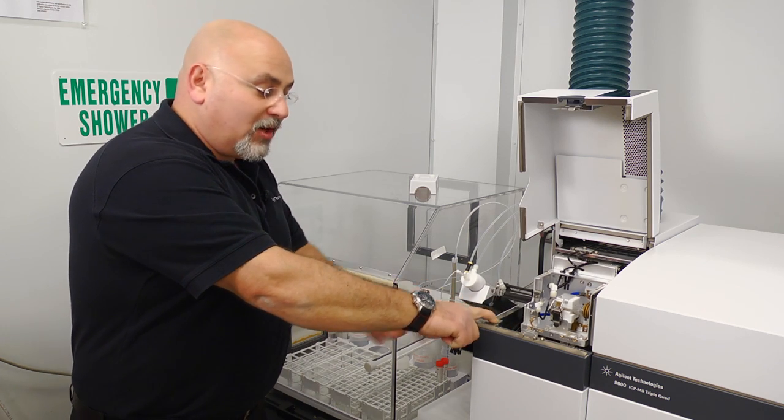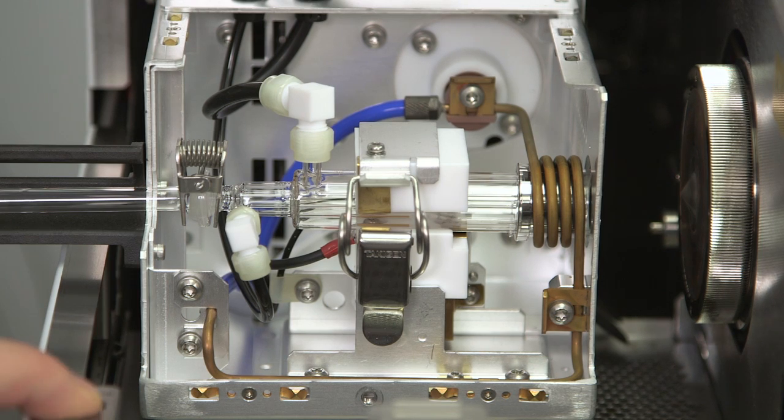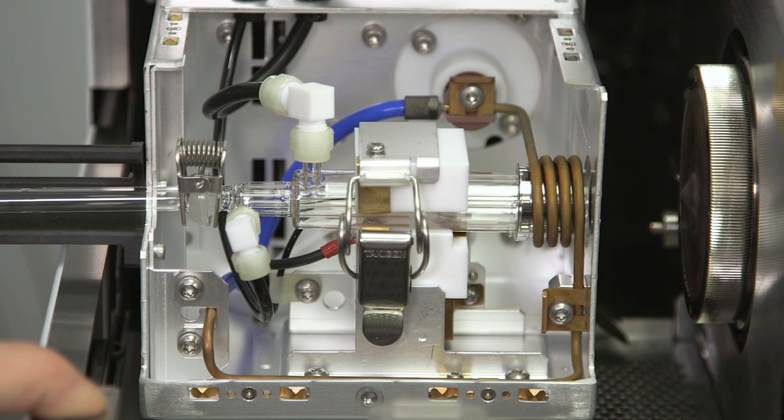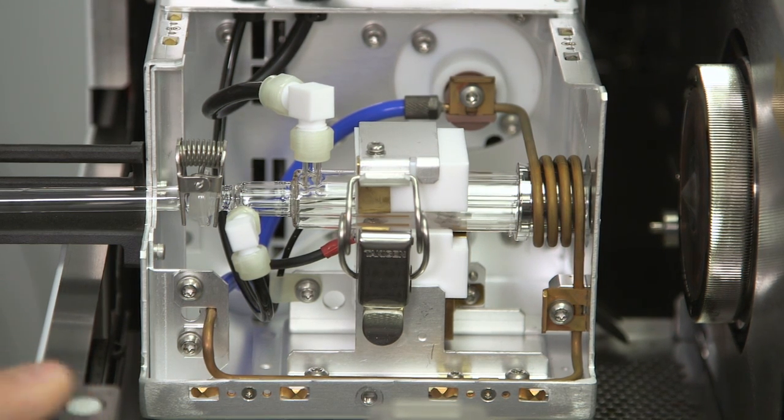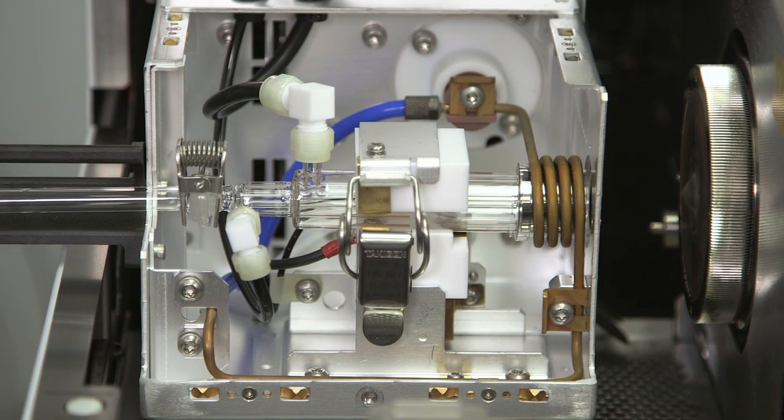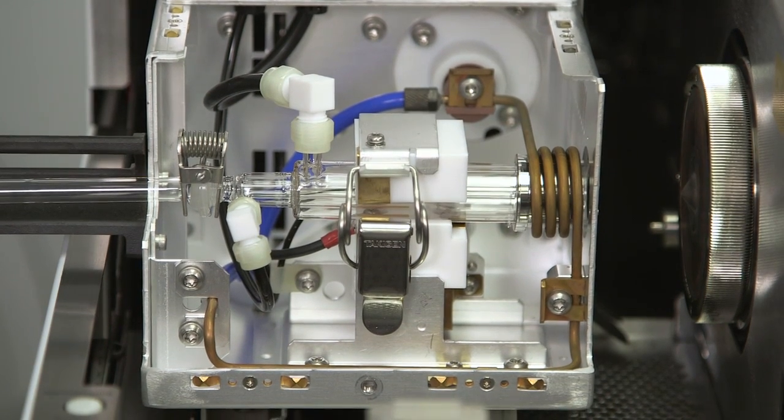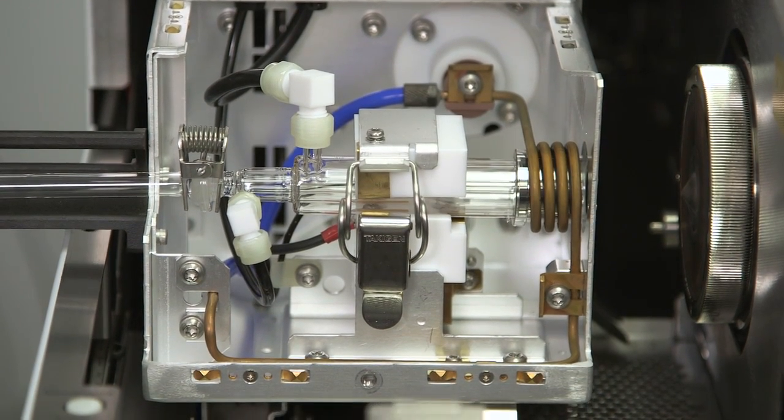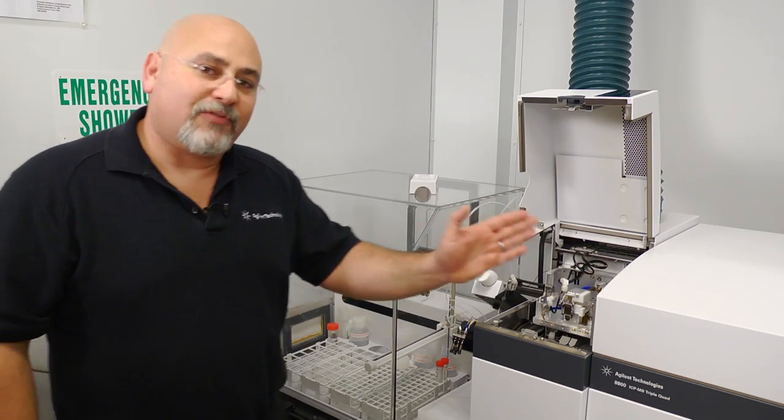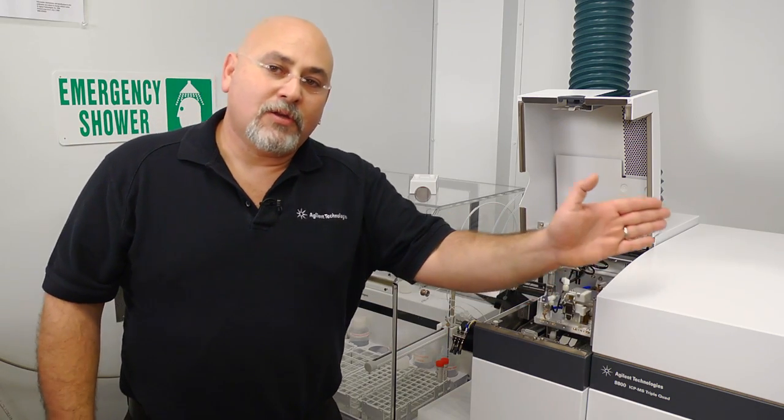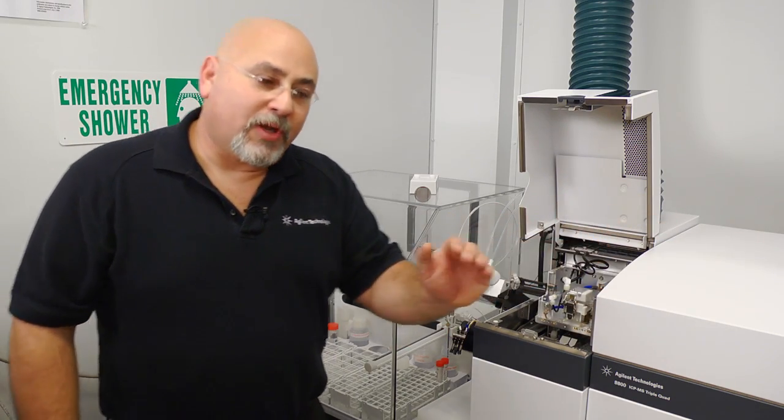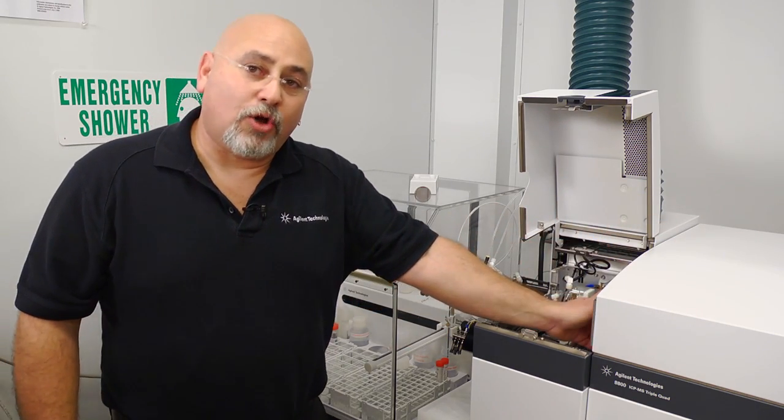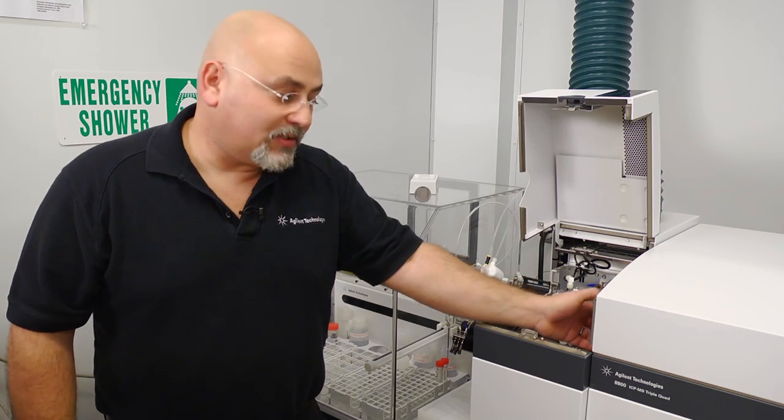We're going to push this little button right here to allow the entire sample introduction to move back so we can access the cones and the lenses, both of which are outside the high vacuum, so you never have to break vacuum in order to access cones or lenses.